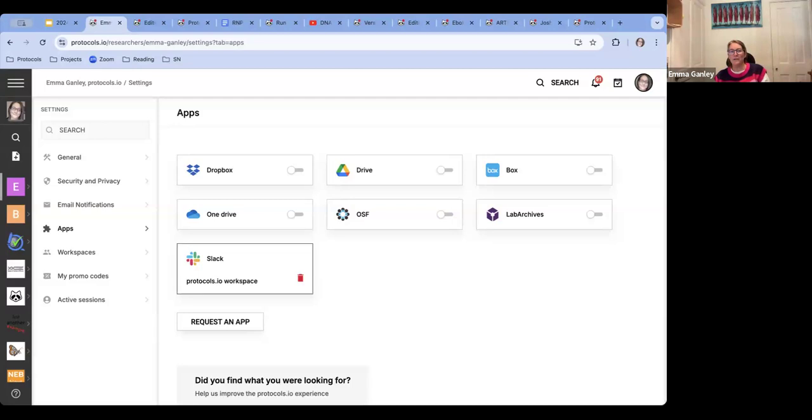And we've never had instances of people being upset that someone has made a fork. I think if they're sharing it on protocols.io, they're open to the fact that other people may come along and use and adapt it. Really, that's a positive about the platform rather than a negative. So we haven't really had any instances of it being an issue. I hope I'm answering that, Gary. If you want, in a minute, I can try and unmute you so you can ask more clearly. But I'll just look at the other question in the chat.